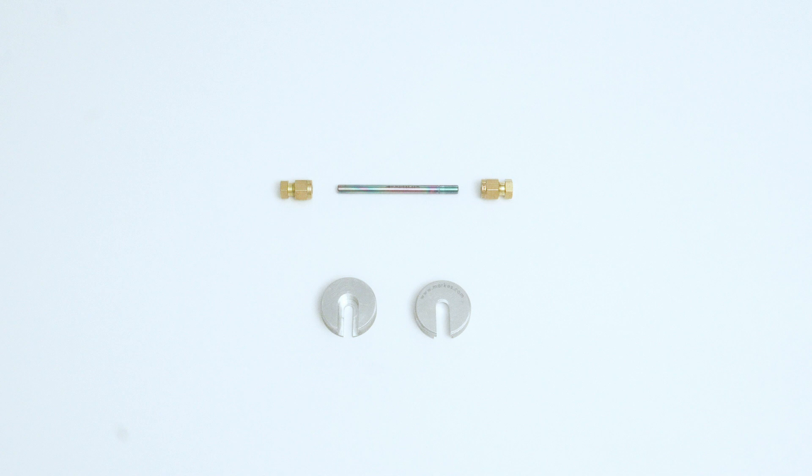The cap lock tool consists of two parts. The top is engraved with the Marks website address and the bottom is not. The bottom part of the tool has a deeper slot to house the bottom of the storage cap.